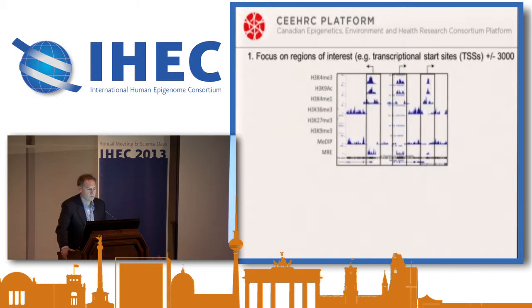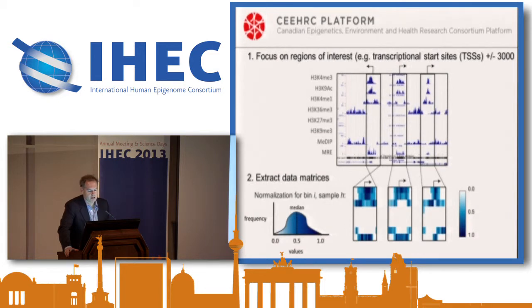Okay. So what we'd want to do, for instance, in this region here, is that we've actually got 3 genes, and they each have a promoter, and you can see that there's different marks collecting across those particular features. And so if we can pull just those regions out down here and normalize the signal and also, of course, correct for the strandedness, we come up with different patterns across those different promoters.